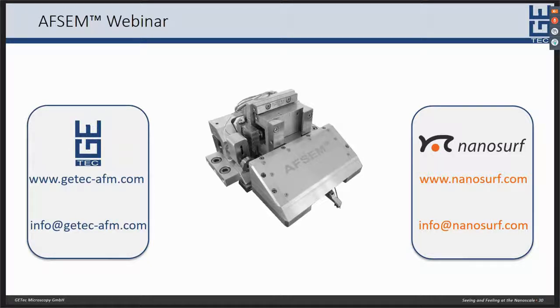One question that was posted is, does the geometry of the AFSEM allow EBSD measurements? EBSD is usually done at really a huge tilting angle, for example at 70 degrees. But depending on the SEM, we can insert the AFSEM in a way that it just tilts with your stage, and you can retract the scanner during the EBSD measurement, so that it does not get in any conflict with the electron pole piece of your SEM.